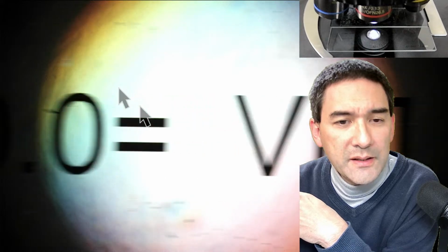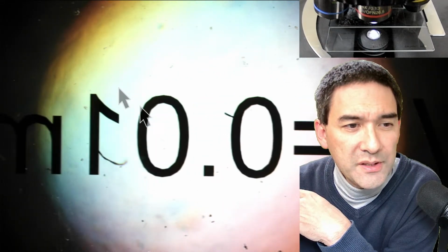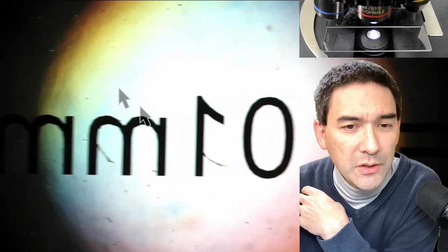Up here is something. So it's upside down. One division, one line, is 0.01 millimeter. So 0.01 millimeter is 10 micrometers. So I have to find this now. Where is it? Where is it? Okay, here we go.